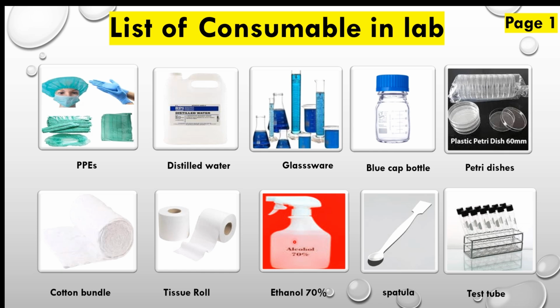We need to clean our workbenches, we need to clean our cabinet, and we need to clean even our instruments using 70% ethanol. A spatula is normally used for weighing samples and water media.